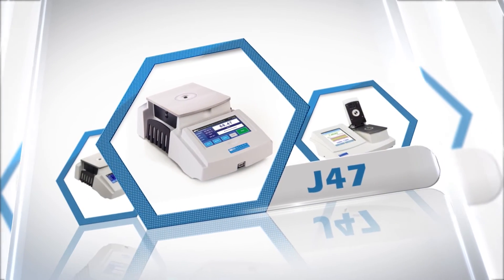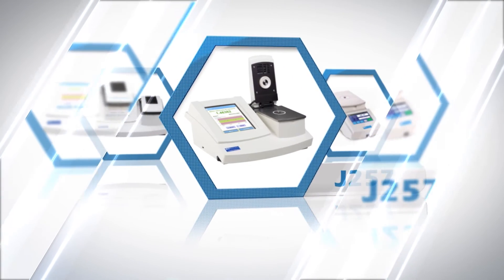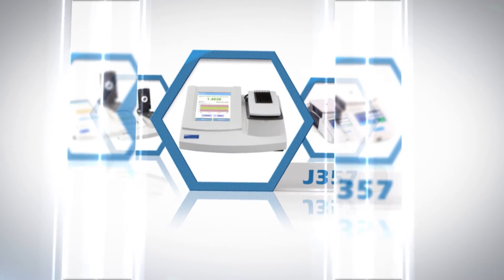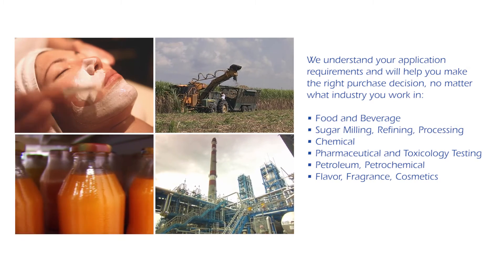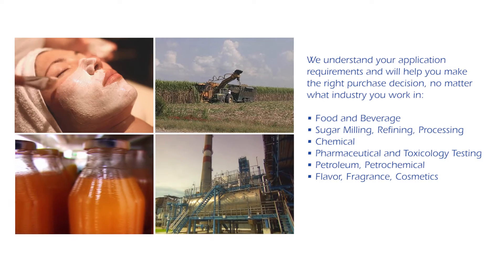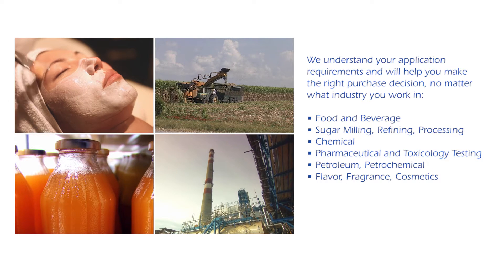We have a refractometer for your application and we're here to help you select the right one. The latest Rudolph Research line of refractometers is designed around innovations that increase performance, accuracy, and ease of use no matter what you're measuring. Our instruments are engineered so the instrument you buy will measure the sample you need under the conditions you need to operate in.